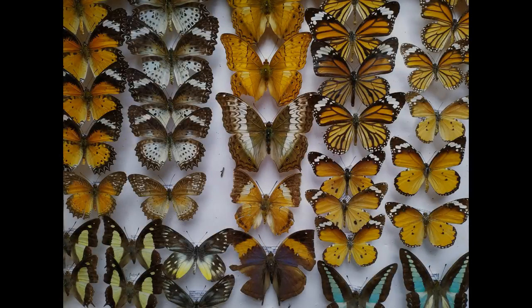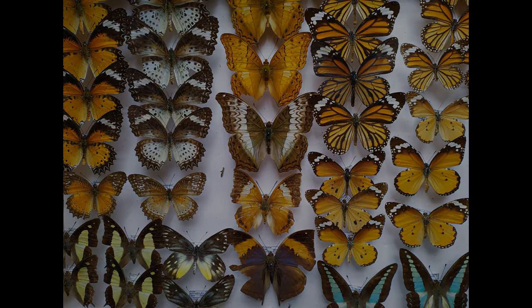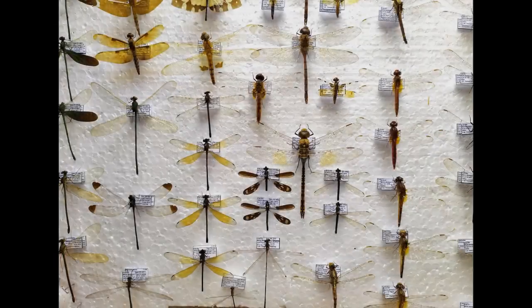Pinning and spreading butterflies and moths, in addition to other groups of insects, are a routine activity in any natural history museum and by insect hobbyists. The ability to pin and mount insects in a proper way is an art in itself and requires a great deal of patience and practice.